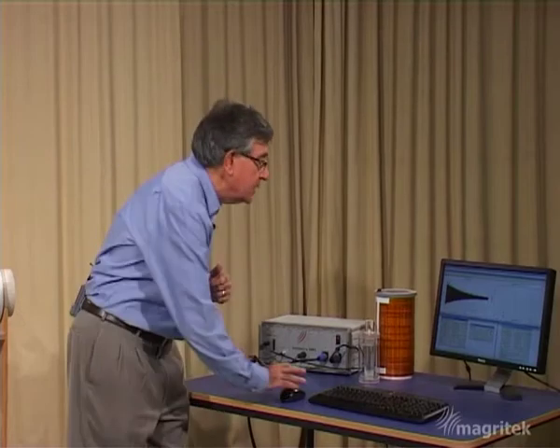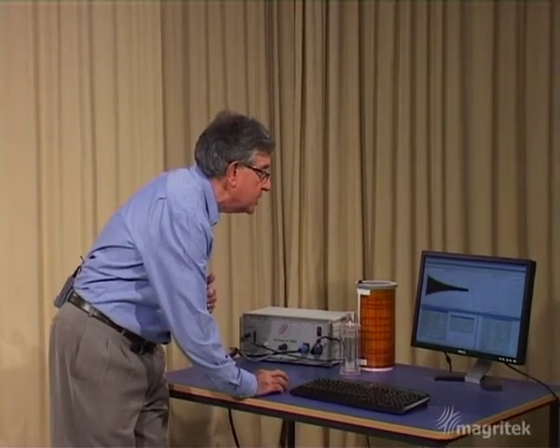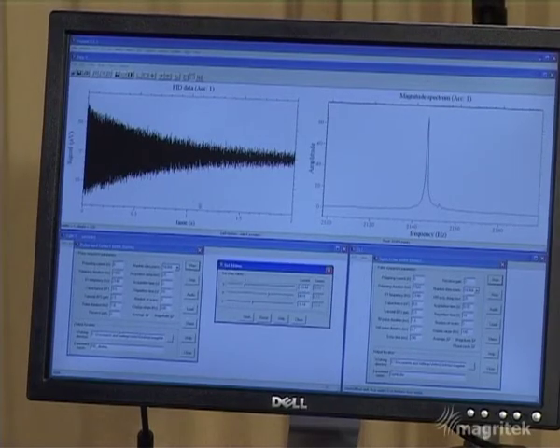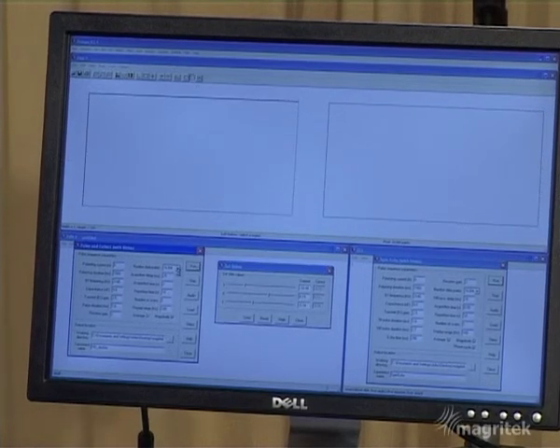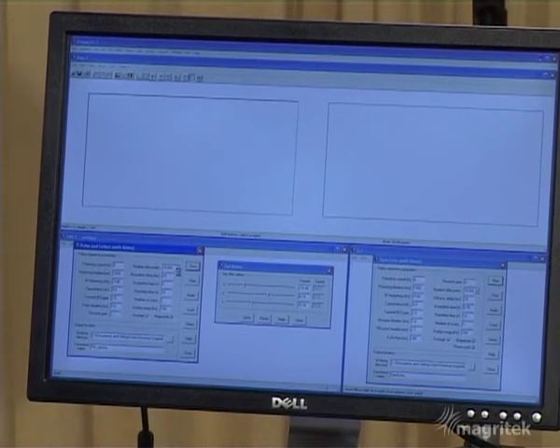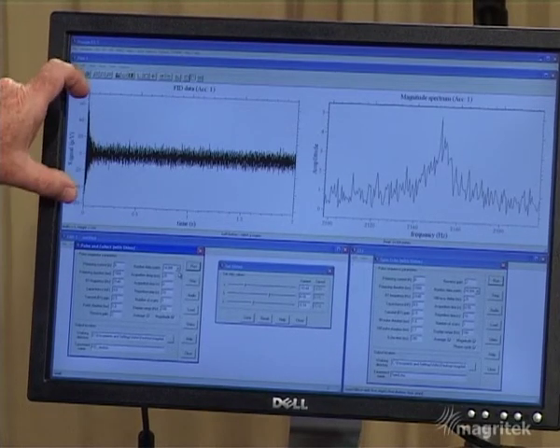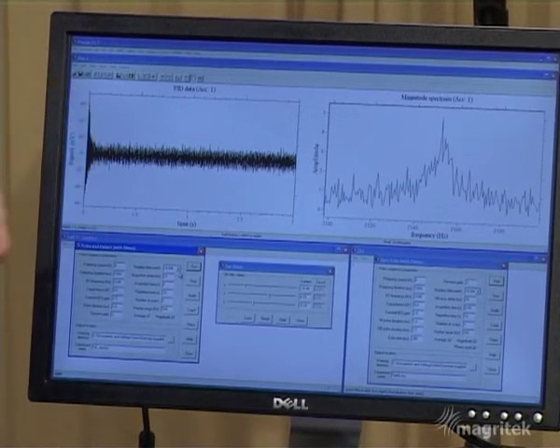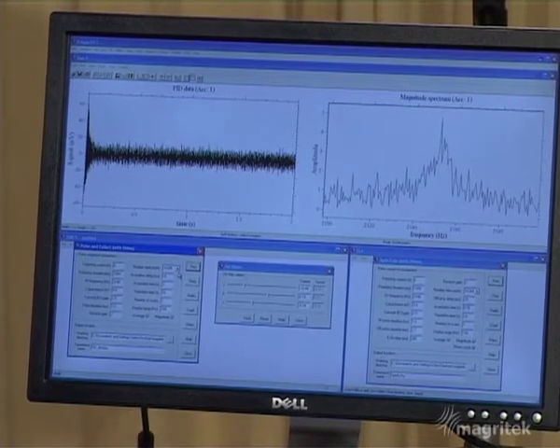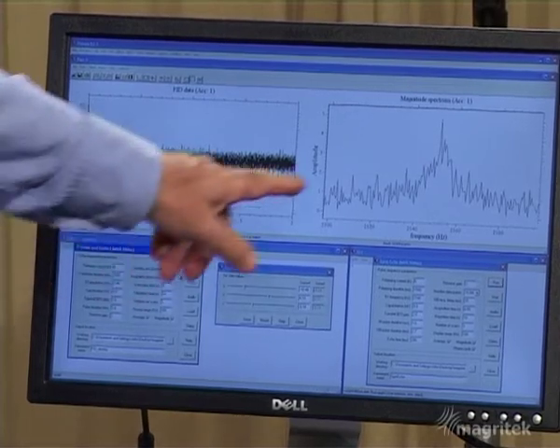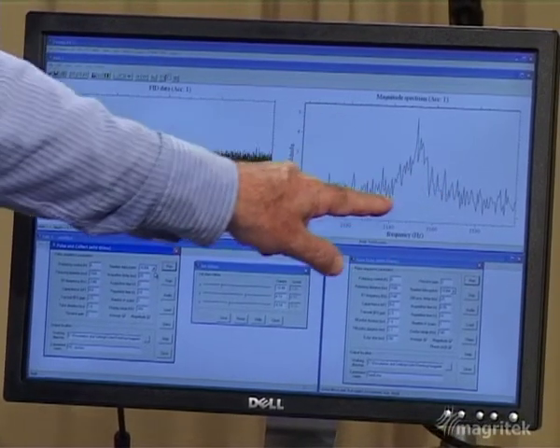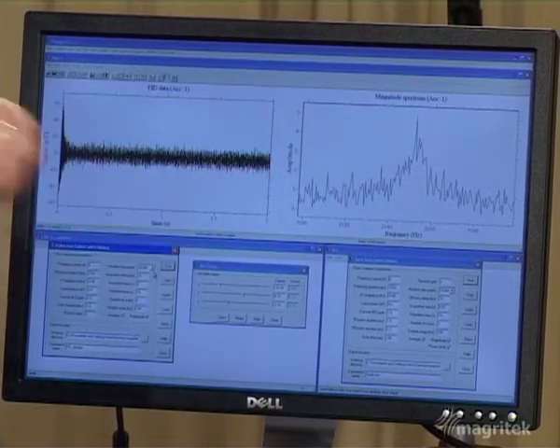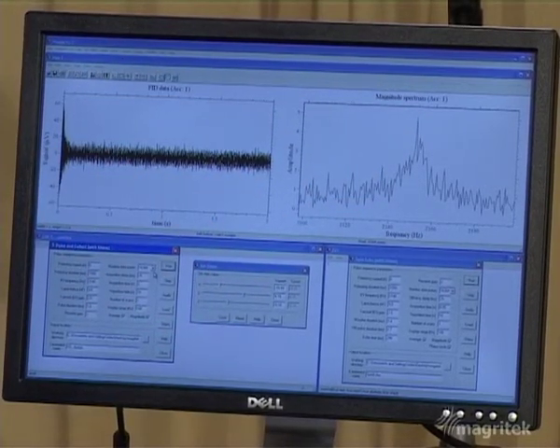By putting the wrong current through the shim coils we can produce a much shorter free induction decay. In order to demonstrate the spin echo trick, it turns out to be very helpful to do that, so I'm going to adjust the currents and run this again. We see a pre-polarizing pulse, a 90 degree pulse, and then a very rapid free induction decay under this now quite inhomogeneous field produced by having the wrong currents in the gradient coils. The result is a very broad spectrum, quite noisy because the height is reduced to conserve the total area.